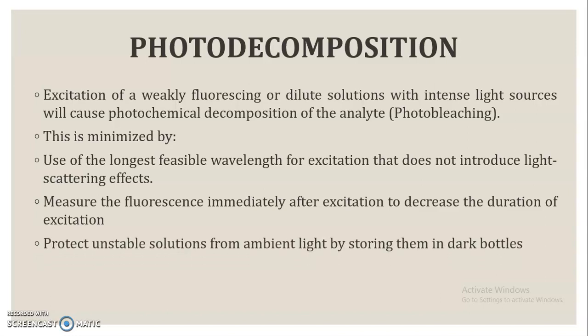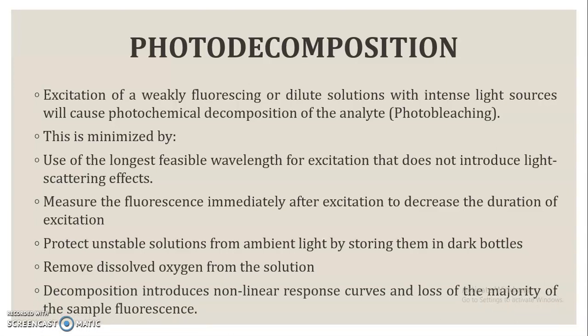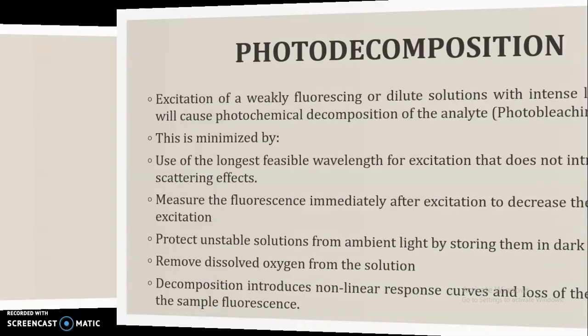Also protect the unstable solutions from ambient light by storing them in dark bottles and remove the dissolved oxygen from the solution, by which we can decrease the photo decomposition effect. Also, decomposition introduces non-linear response curves and loss of the majority of sample fluorescence is observed. That's why it is necessary to minimize the photo decomposition effect.